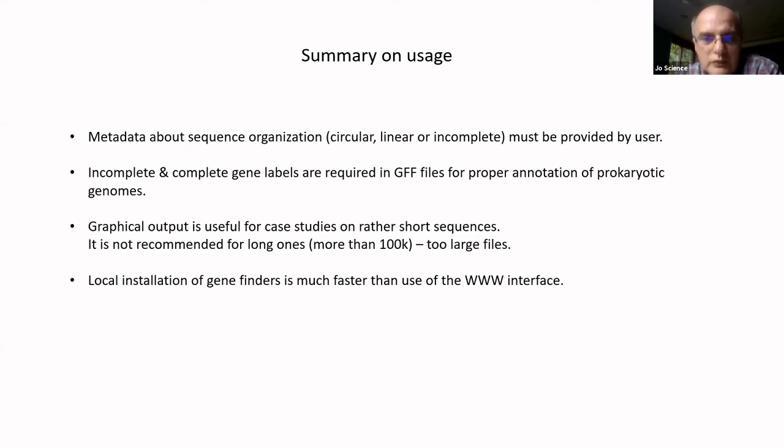Graphical output is very useful if you are working with a specific gene or a specific group of genes. Please use it. I'm always using it myself. It gives me a very intuitive understanding of what is going on. But please don't use it on large genomes. You will just run a website for nothing, because it's really impossible to go through all the graphs.